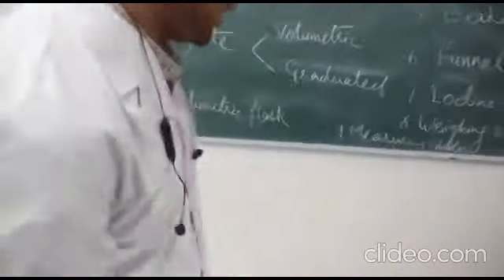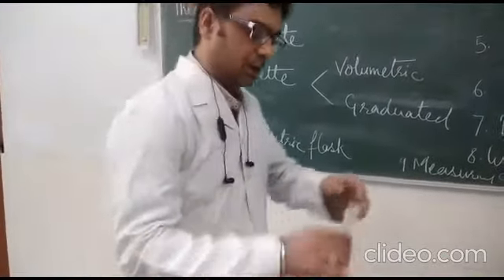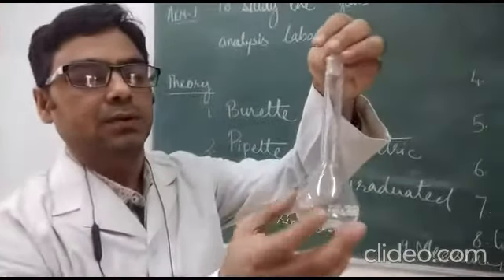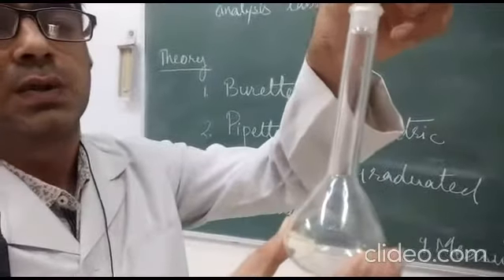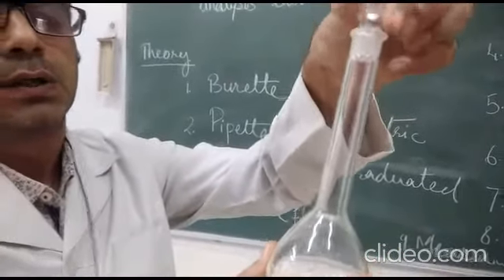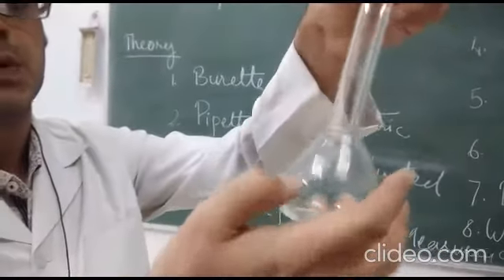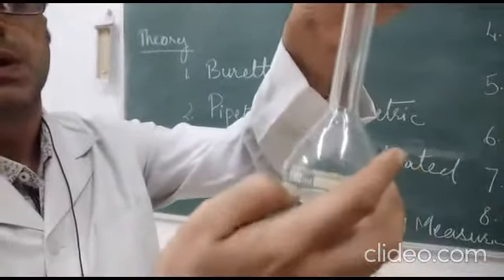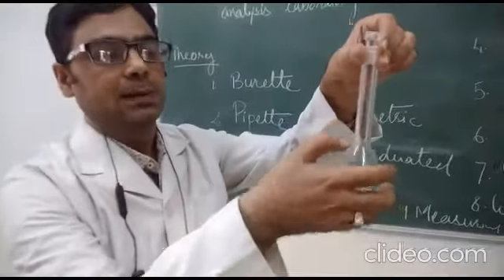Next we have the volumetric flask. This is the volumetric flask — we have already shown you pictures of it, and now we are showing how you will use it in the lab. It has a cork stopper and a single mark denoting its volume. This one is of 100 ml, so the mark indicates the 100 ml level.